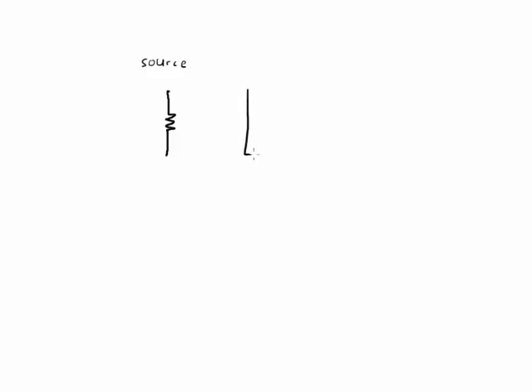Next thing I'm going to draw here is a sample cell. The sample cell is where the sample flows through, as well as where you would introduce the zero gas and the span gas to calibrate the analyzer. We also have a detector. This is a non-specific IR detector that can detect a broad range of wavelengths of IR.